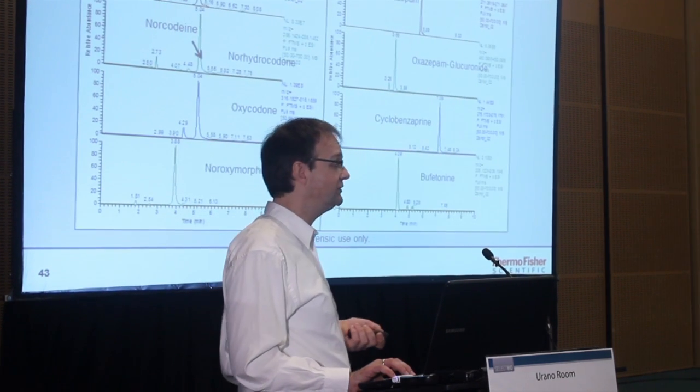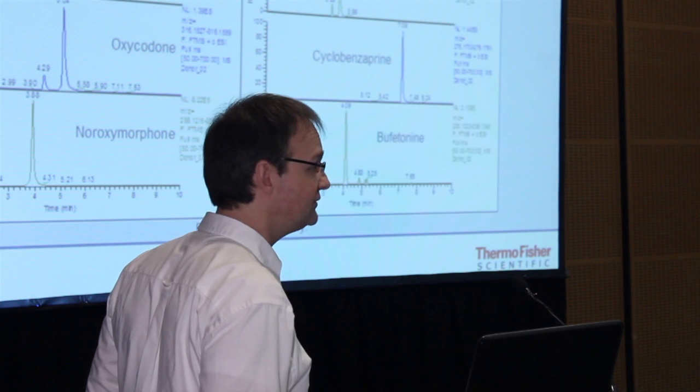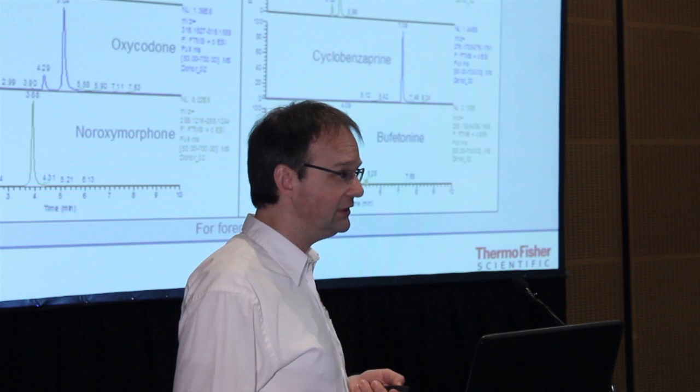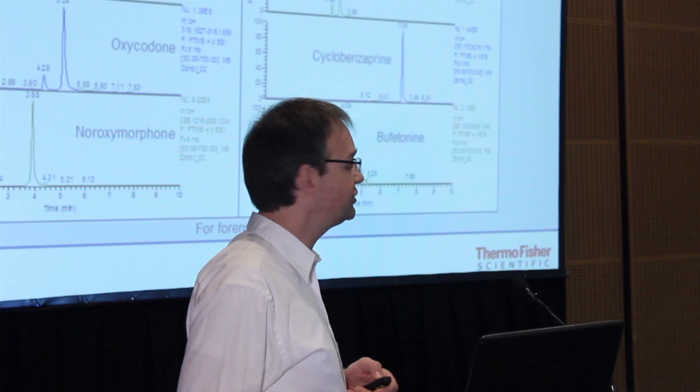And the second sample even contained a couple more, so I don't show the scans across the peak, but we get nice peaks here. They are not somehow edgy because they only contain 2 scans or something like that. So we get really the nice peak shape because we get enough scans across the peak despite the polarity switching.